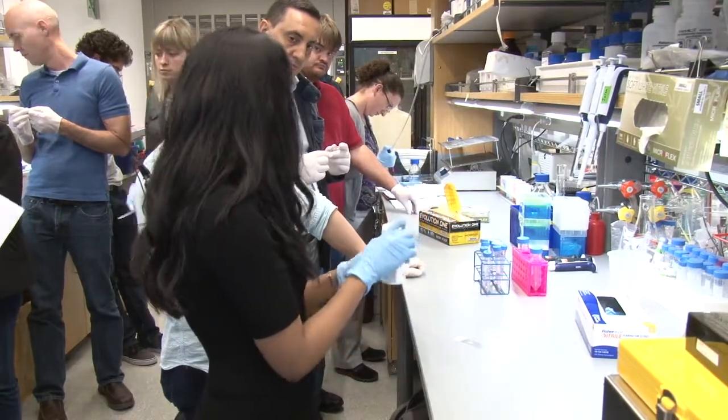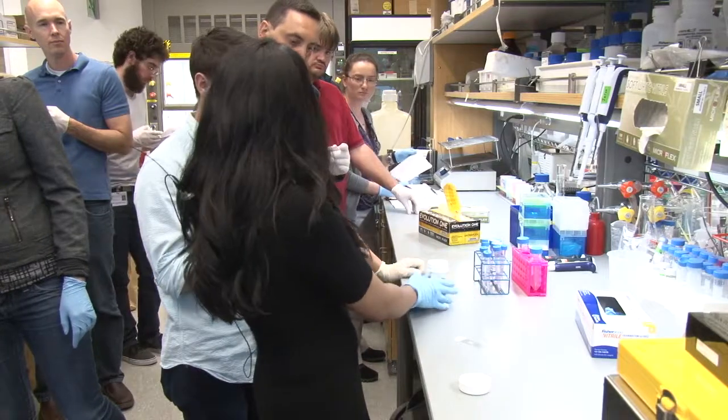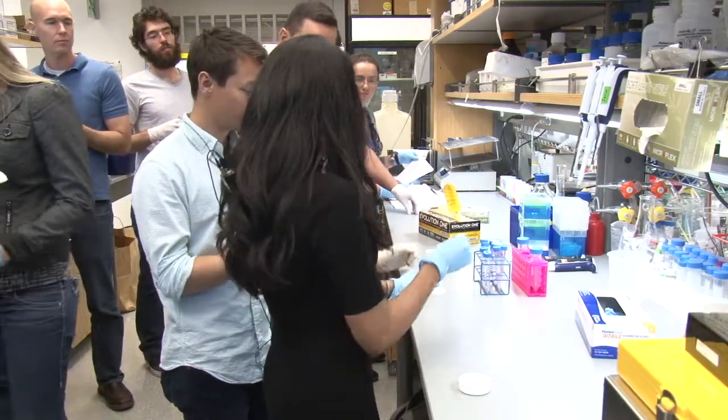We usually use these jars. This is not fixated, but this is typically how you would do it — you can just put your slides in here.